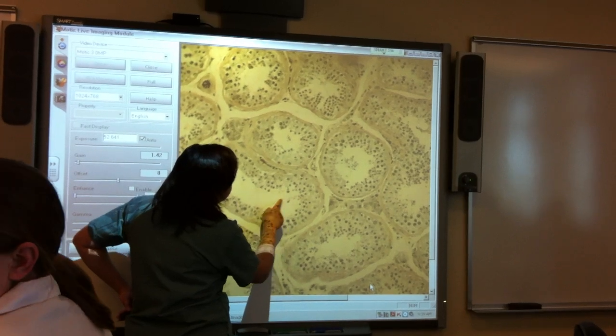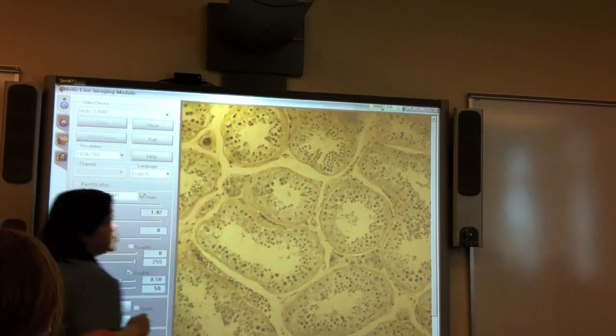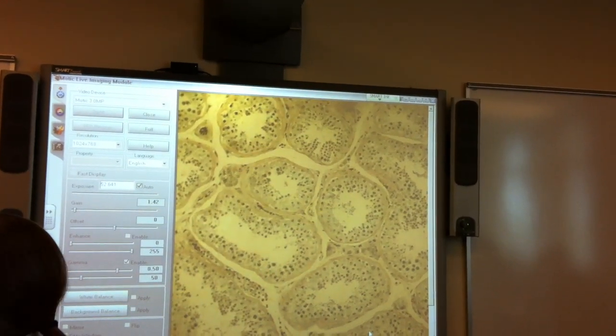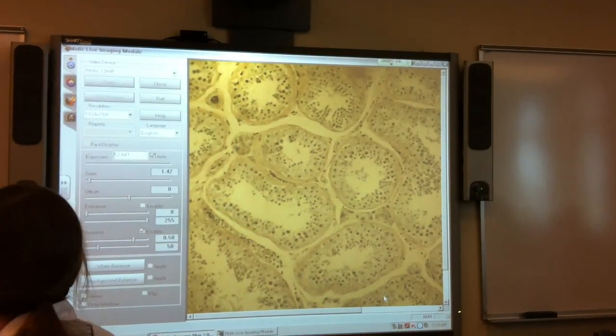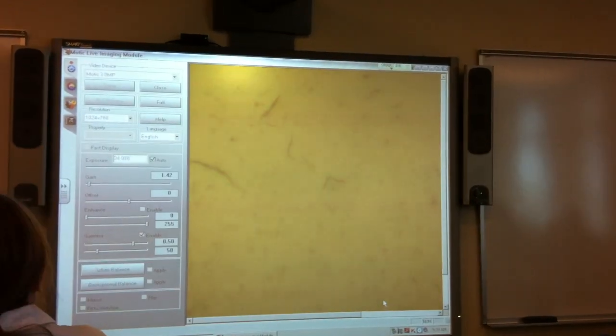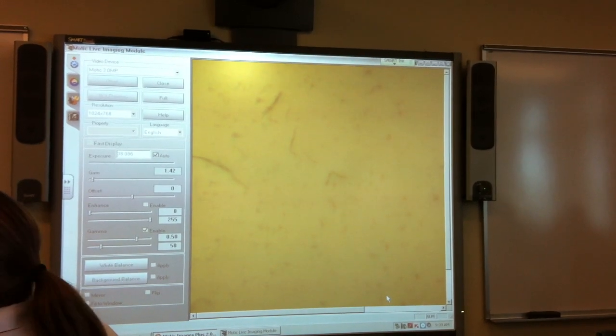And then there are cells here, and a lot of times you can actually see the tails. And if you see the tails, they're immature sperm. Questions on that? Some slides have better immature sperm in here. I just don't have one. Here we go.